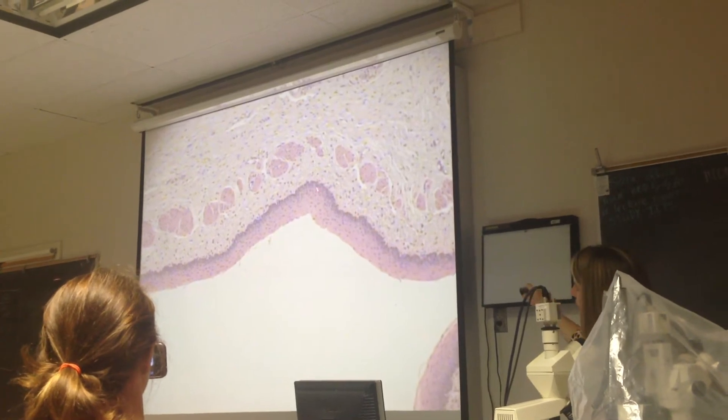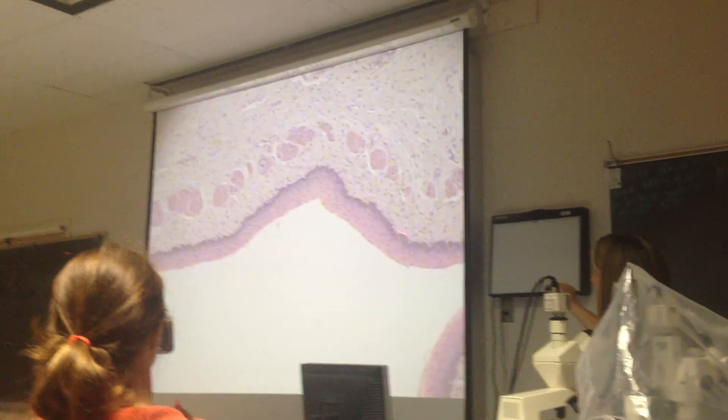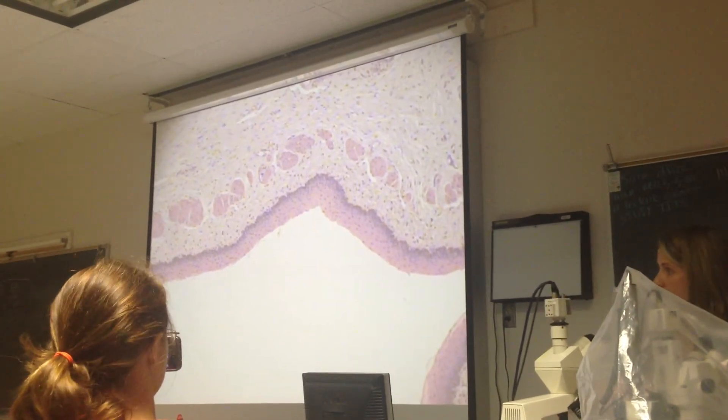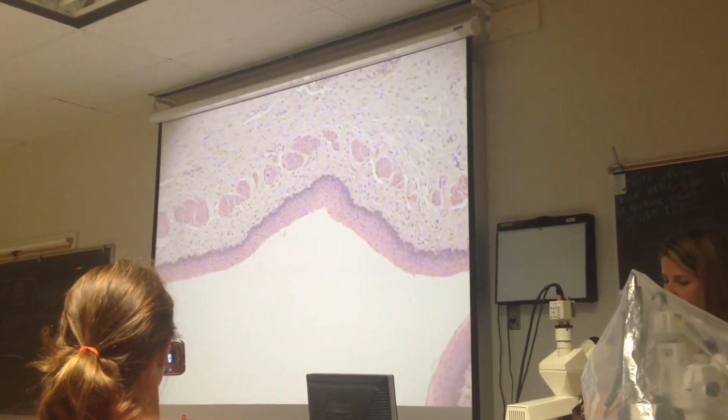See how it gets darker down at the basal surface? Why is it darker? Why is there more cells? More cells, more of the nuclei — the stem cell nuclei. So let's move up magnification.